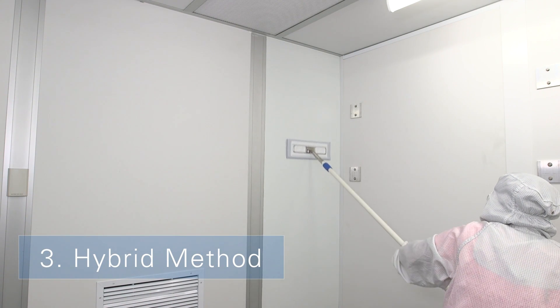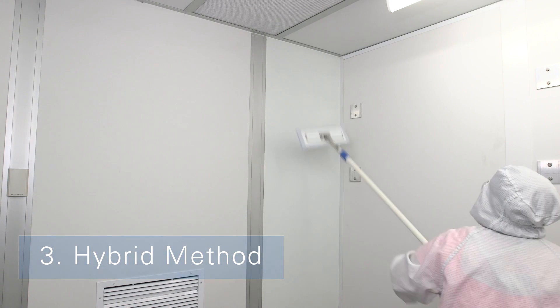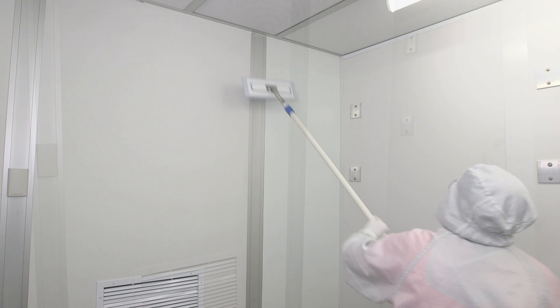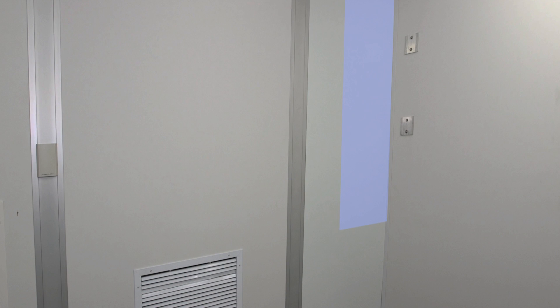The third method combines both vertical and horizontal patterns so that the contamination from below table height is not transferred up to the ceiling. This is the manufacturer's recommended method.